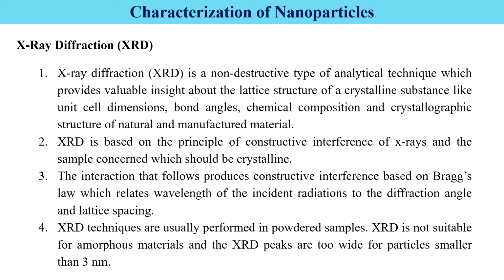When we study the XRD of nanoparticles, if sharp peaks are seen, then we say that the nanomaterial is crystalline in nature. And if wide, broad spectra are seen, then we say that the material is amorphous. That is, the XRD technique is also useful to determine the nature of the nanoparticle materials.